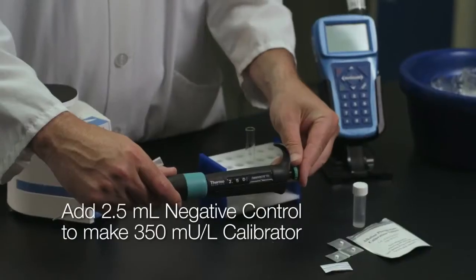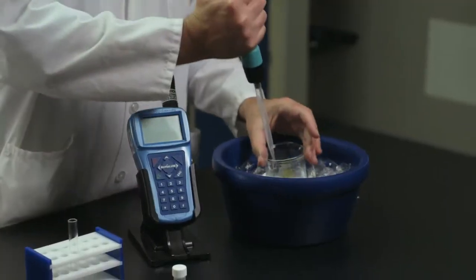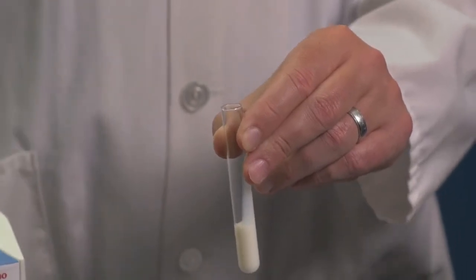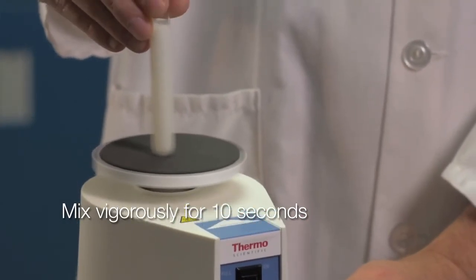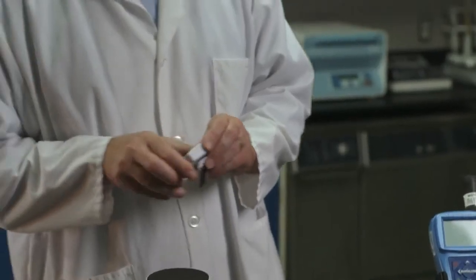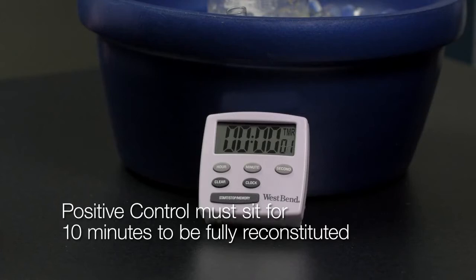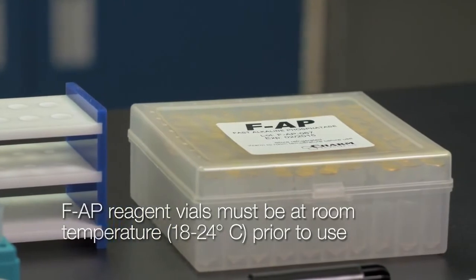Add 2.5 milliliters of negative control to make a 350 milliunit per liter calibrator. And always remember to mix vigorously before each use. The positive control must now sit for at least 10 minutes to be fully reconstituted. FAP reagent vials need to be at room temperature prior to running tests.